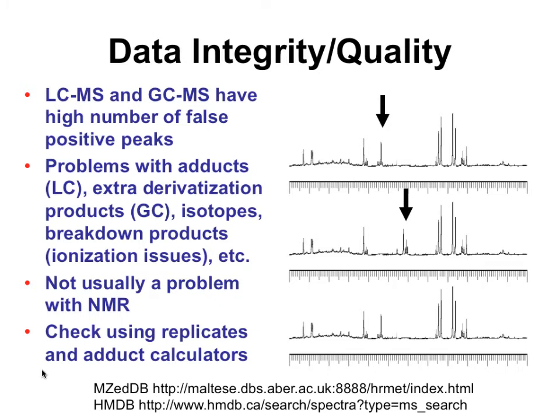So the data integrity issue, it's a particular problem with LCMS. It is also a problem with GCMS. There's lots of fake peaks in all of the data. So we learned about adducts, neutral loss issues. In GCMS there's the extra derivatization products and that's why you have to run blanks. There are isotope peaks and you have to do deisotoping. There are inadvertent breakdown products and you have to deal with those. This issue of false positives is not a problem with NMR. That's one of the reasons why we chose to do it as an example. It was just a little cleaner for you guys, but since most people don't do NMR, it was done as largely an example.